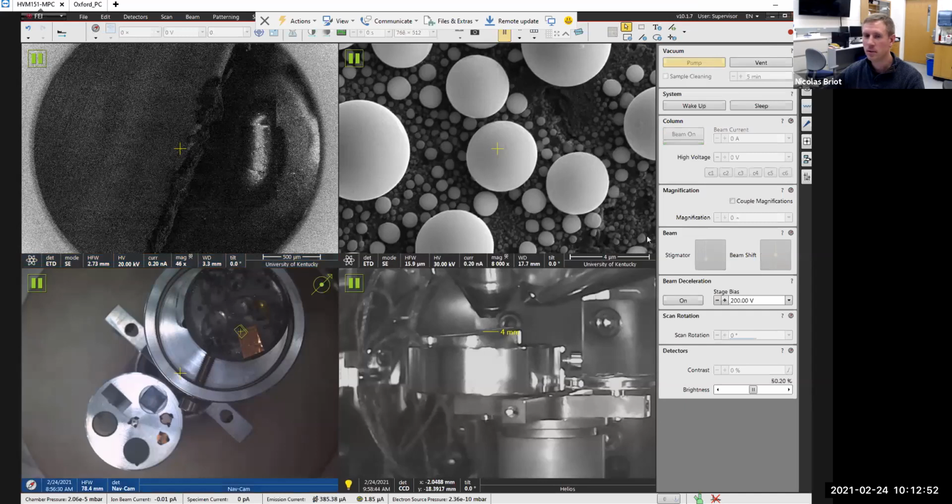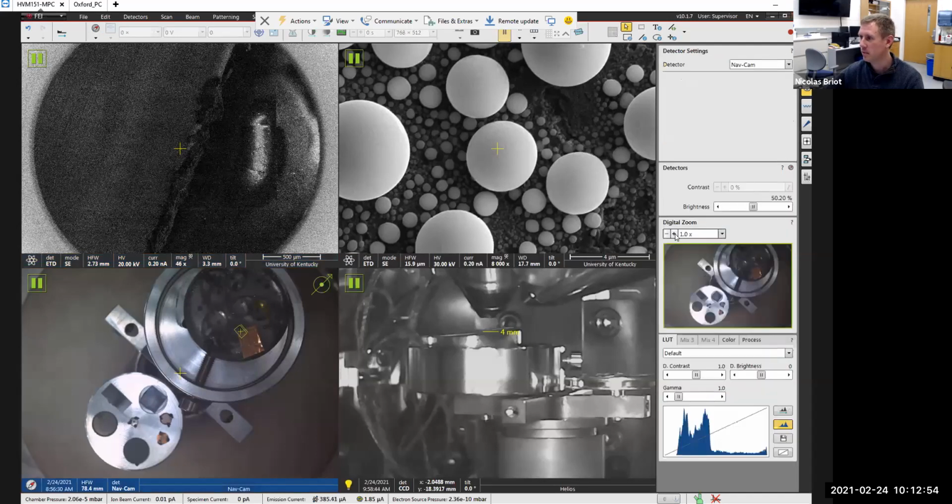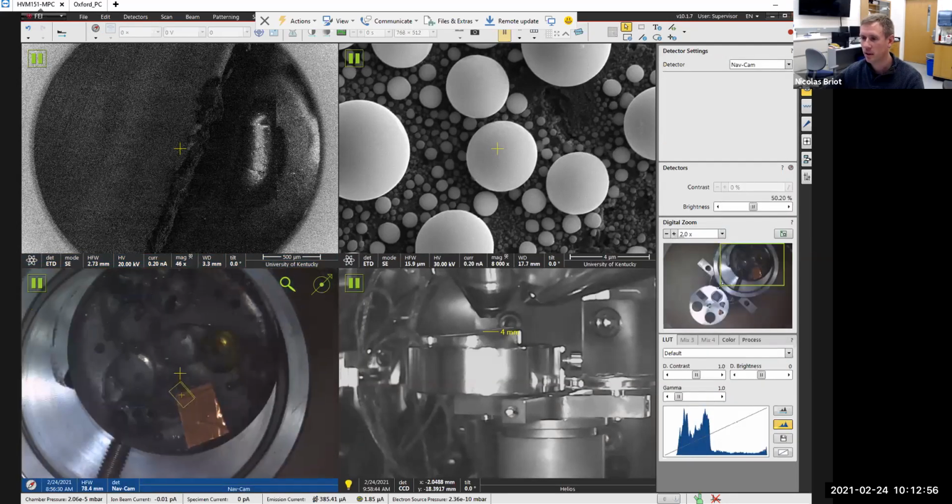So we're going to now look at your samples. I can zoom in here. I think this is the green and the blue one, and then you have the yellow one here. Any preference which one we start with, or should we just start with this one? It doesn't matter for me. That one's probably the most likely to see silver. Okay, well, let's do it.